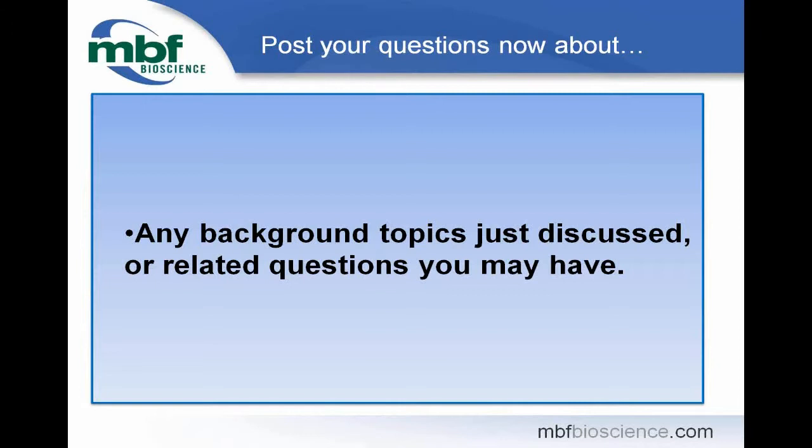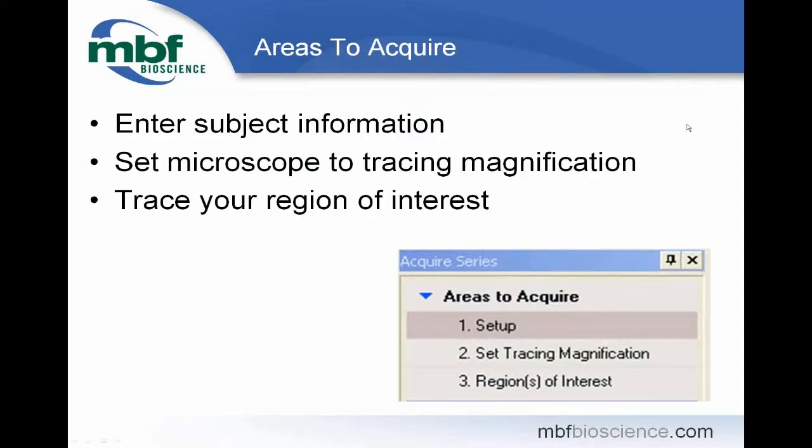Please post any related questions you may have now before we begin our live demonstration of the SRS Image Stack acquisition workflow. So now, let's begin our live demonstration on how to acquire SRS Image Stack series using the SRS Image Stack series acquire workflow.